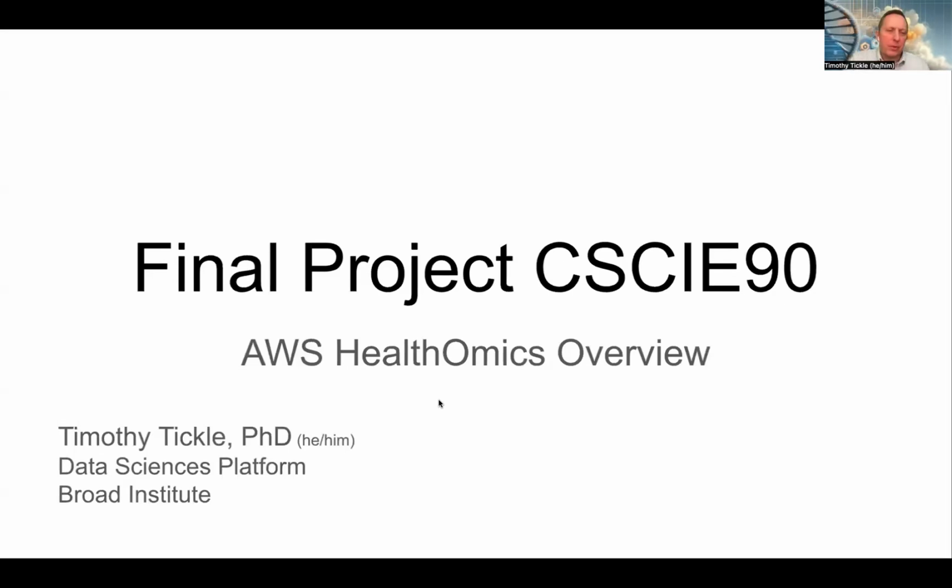Hi, I'm Tim Tickle. I'm here to talk to you a little bit about my final project for CSCIE90, where I used AWS Healthomics to perform processing and analysis of short read sequencing data.